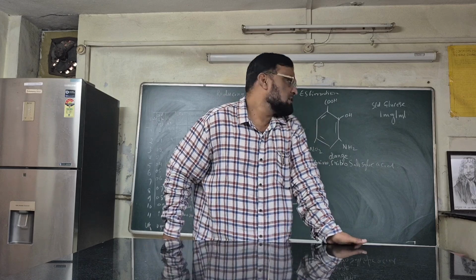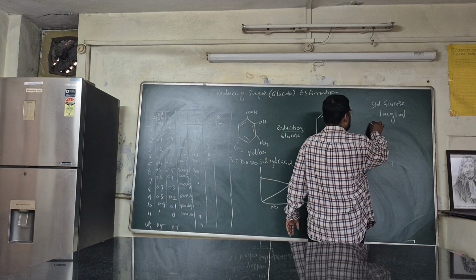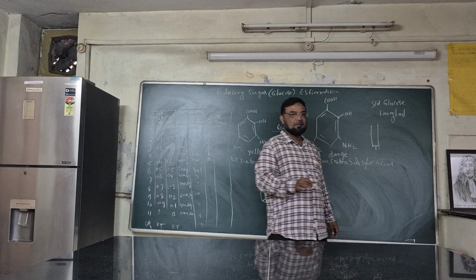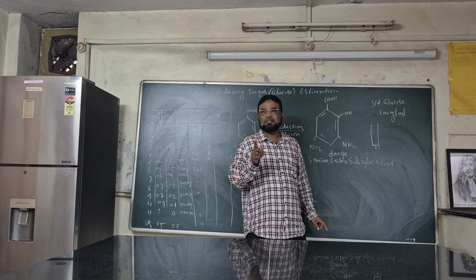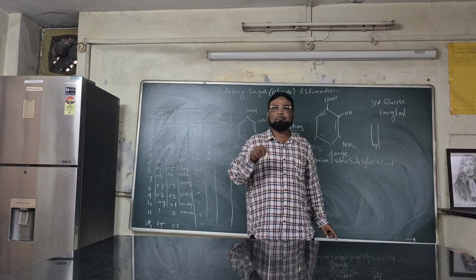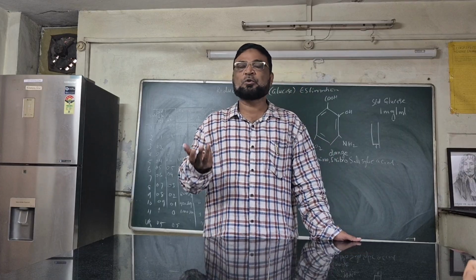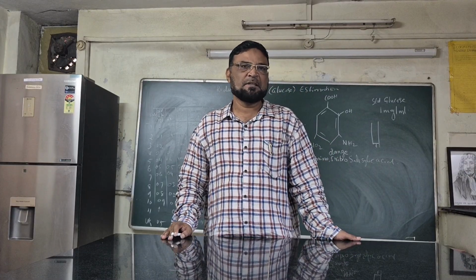This is a cuvette, no? Yes. So the length of the cuvette should be constant. It should not be altered. In these two conditions, the light absorbed by the substance is directly proportional to the concentration of the substance. This is what Beer-Lambert's law states.